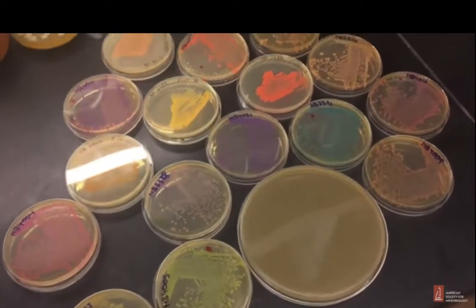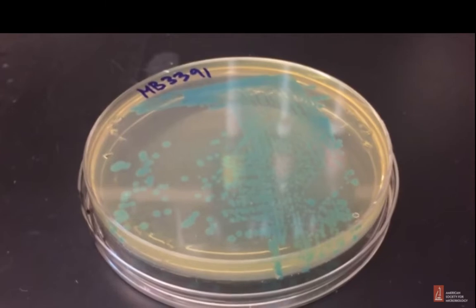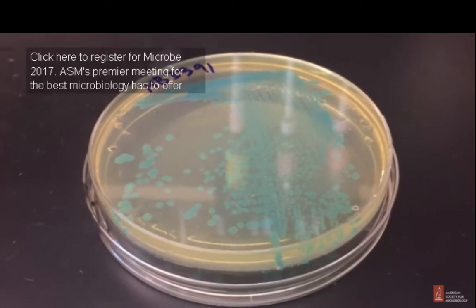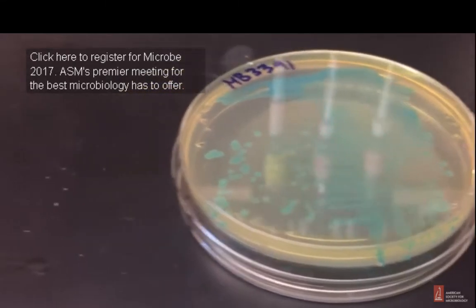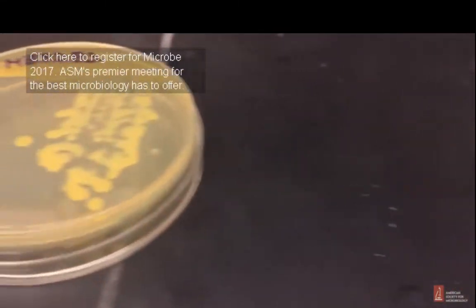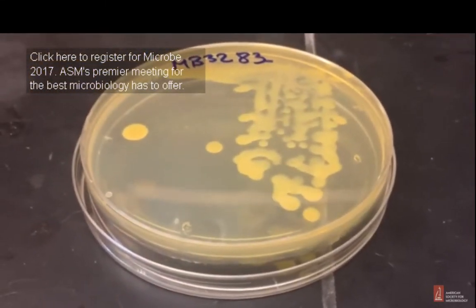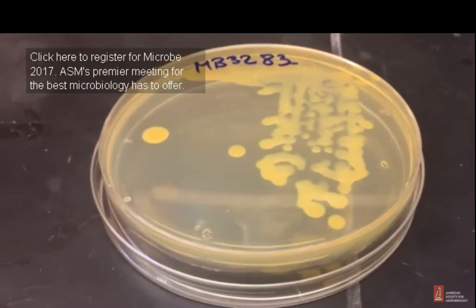You can use microbes that are genetically engineered to be colorful, such as E. coli that produce chromogenic proteins. These are available from a number of companies, or you can even make your own using bacterial transformation. There are other bacteria that are naturally colorful. In this case, we're using Xanthomonas from NEB's collection, or these can be purchased from a biological supply company as well.